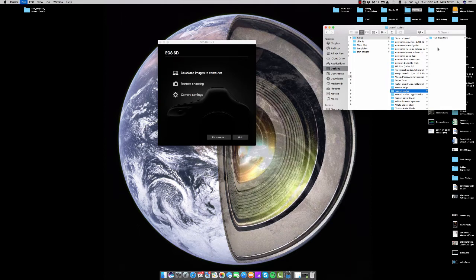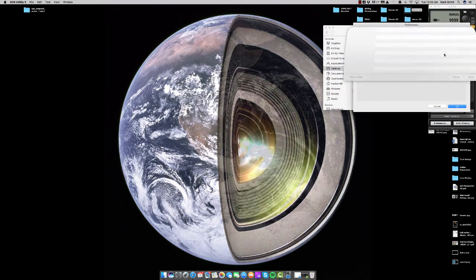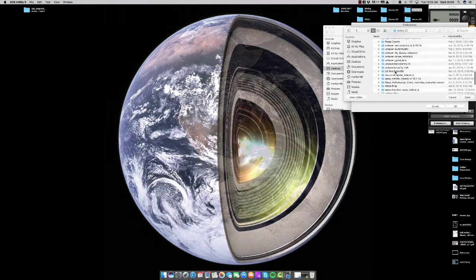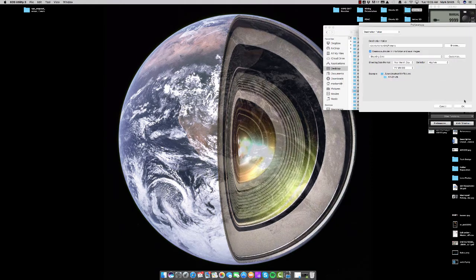There's the 10x objective folder. We're just going to change this and create a new folder that says 20x objective. And we're going to turn on remote shooting and navigate to that 20x folder — active 2D, Weevil scales, 20x objective — and open it up and hit OK.